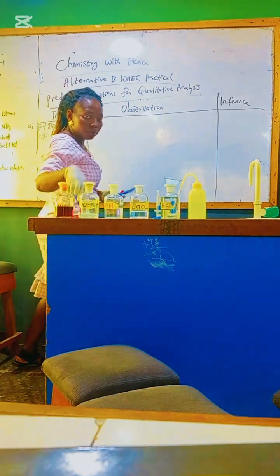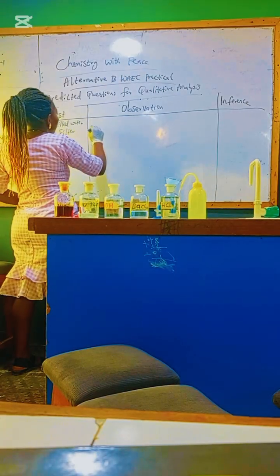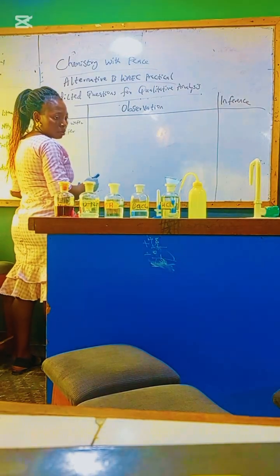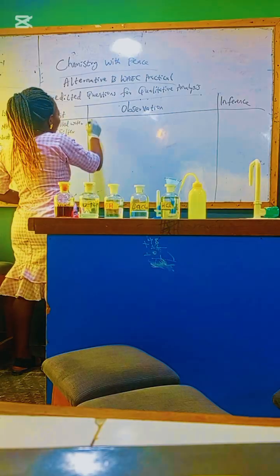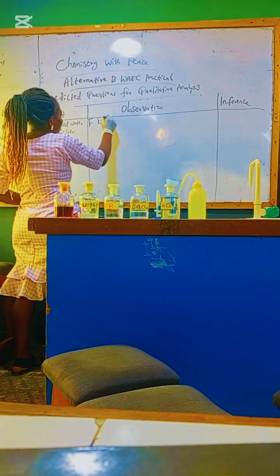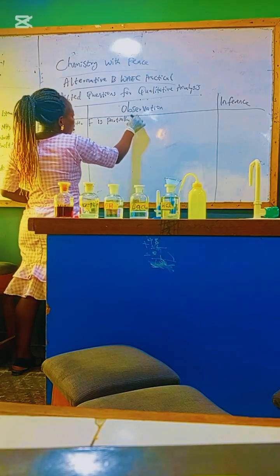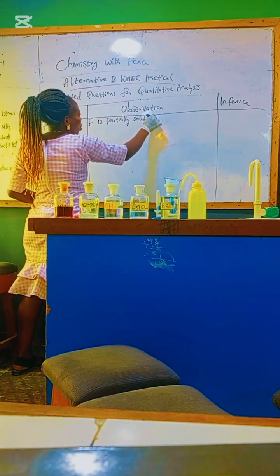Observation: F is partially soluble in water.